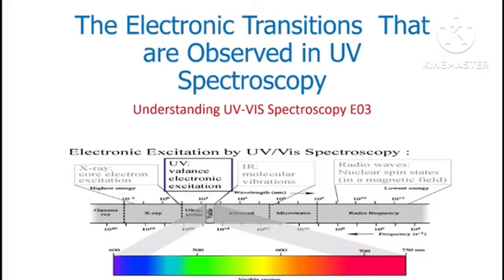Electronic transitions that are observed in UV spectroscopy. That is what today's video is specifically about.